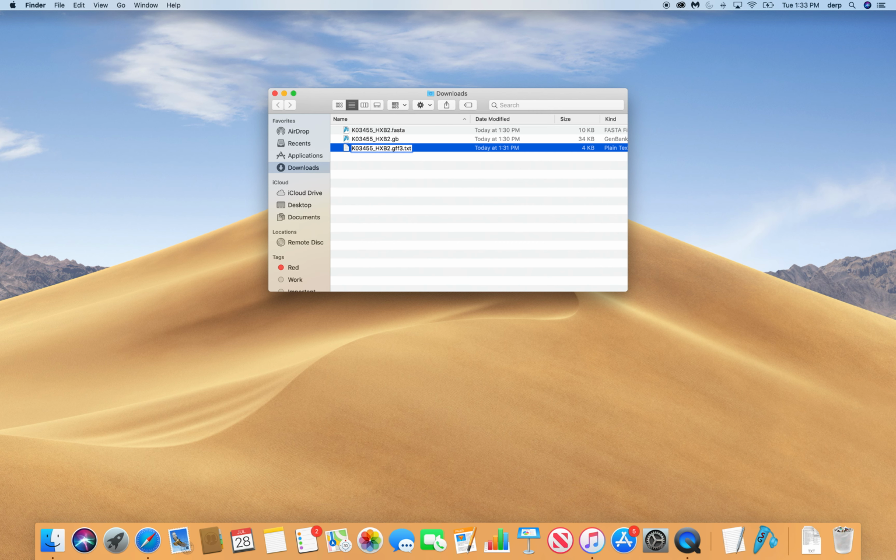And then for looking at the information in this file, keeping it as a .txt is useful. But for using it in some informatics applications, they actually want to see this ending, this file type ending. So sometimes we may actually need to delete this, but we can keep it like this just to do some exploration. I did want to take this time before we finish today to actually go through these different file types. I may actually separate this as a separate video. We'll see how that goes.